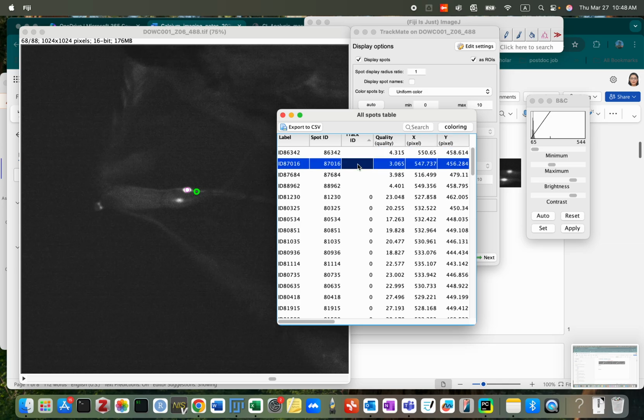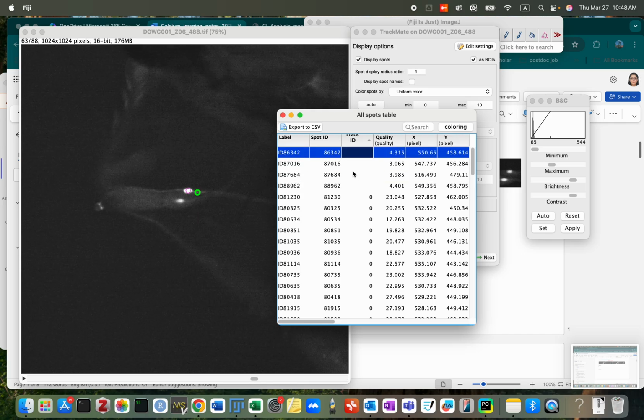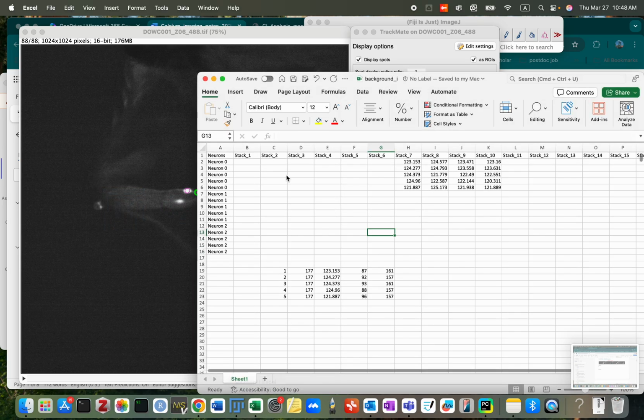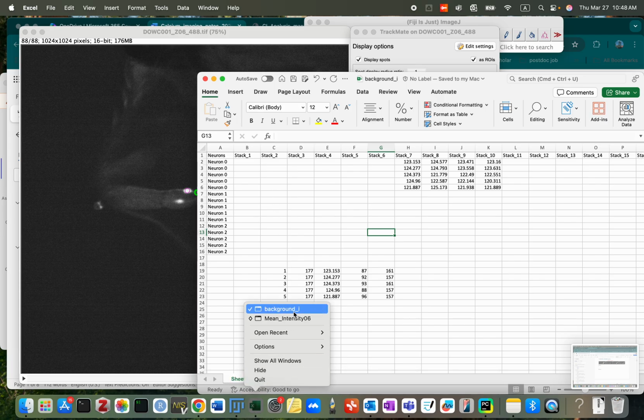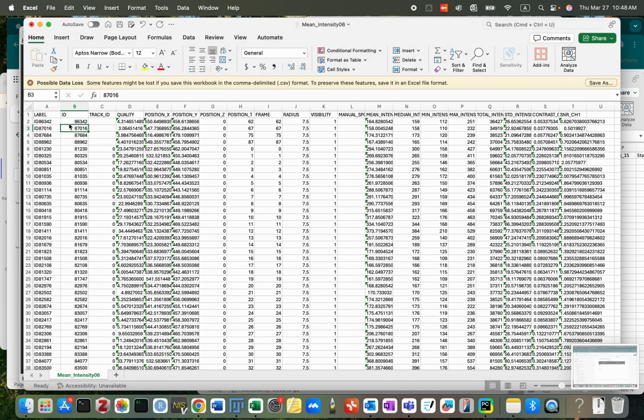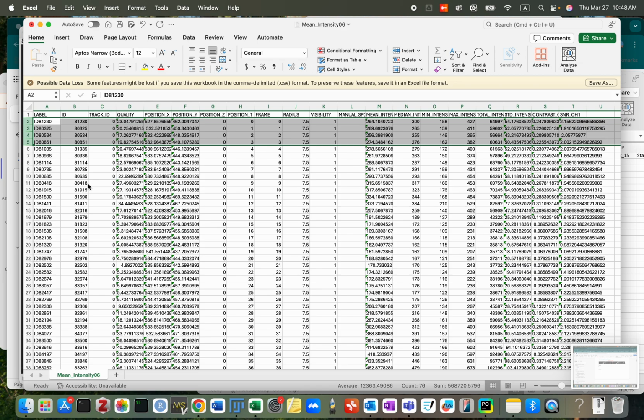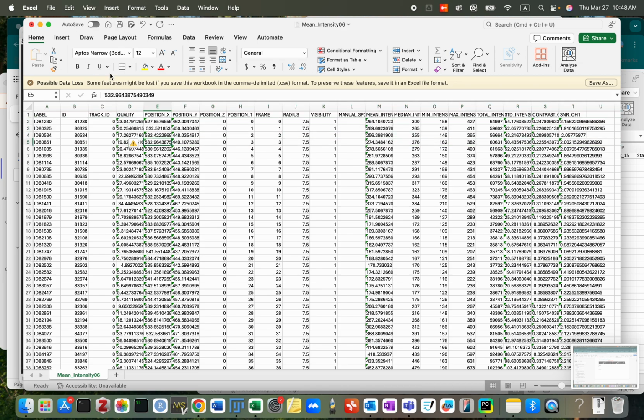Okay, let's check the first. A couple of data with no checking ID, they are all wrong selections. We delete them. So when you work with the stacks, I hope everyone can draw this image in your brain to imagine how the scanning microscope did. From stack 10, it's now continuing to scan upper or lower, but now the center is away from the center, right?